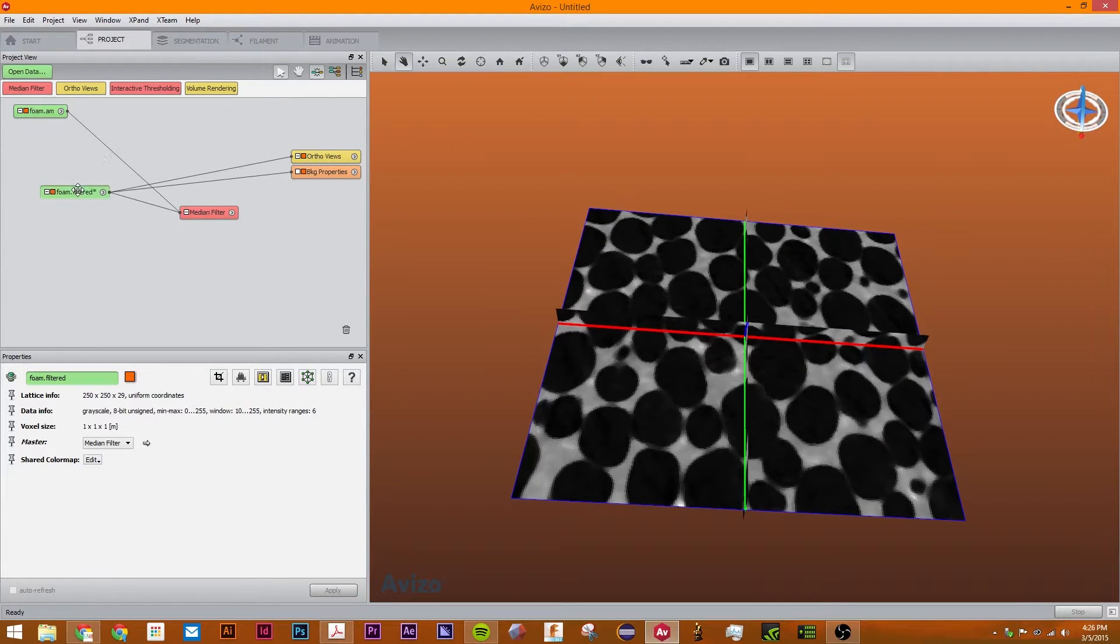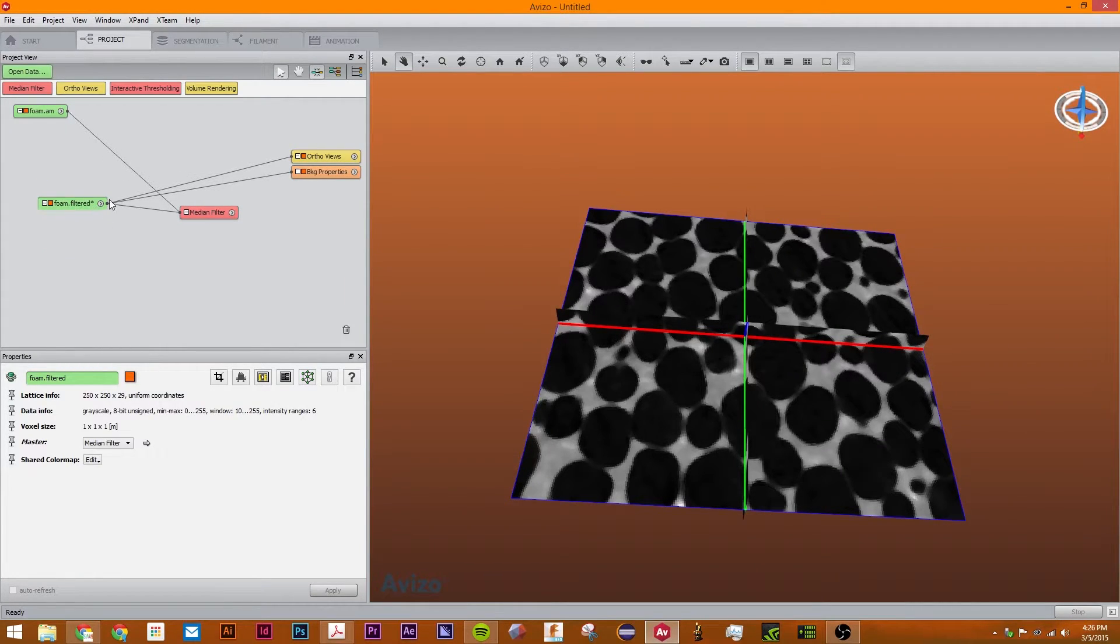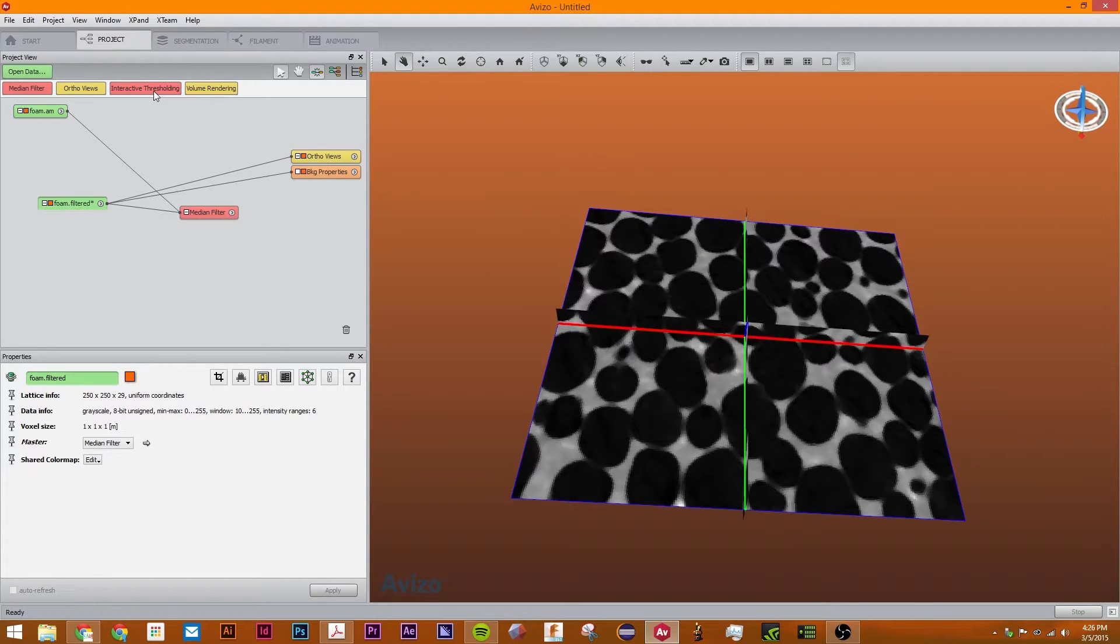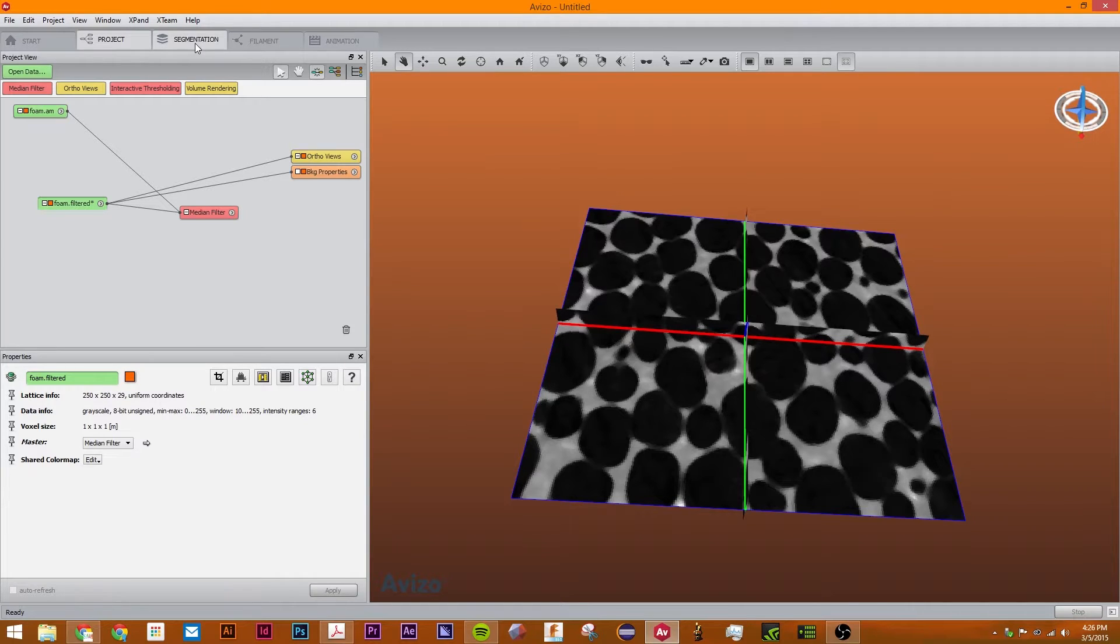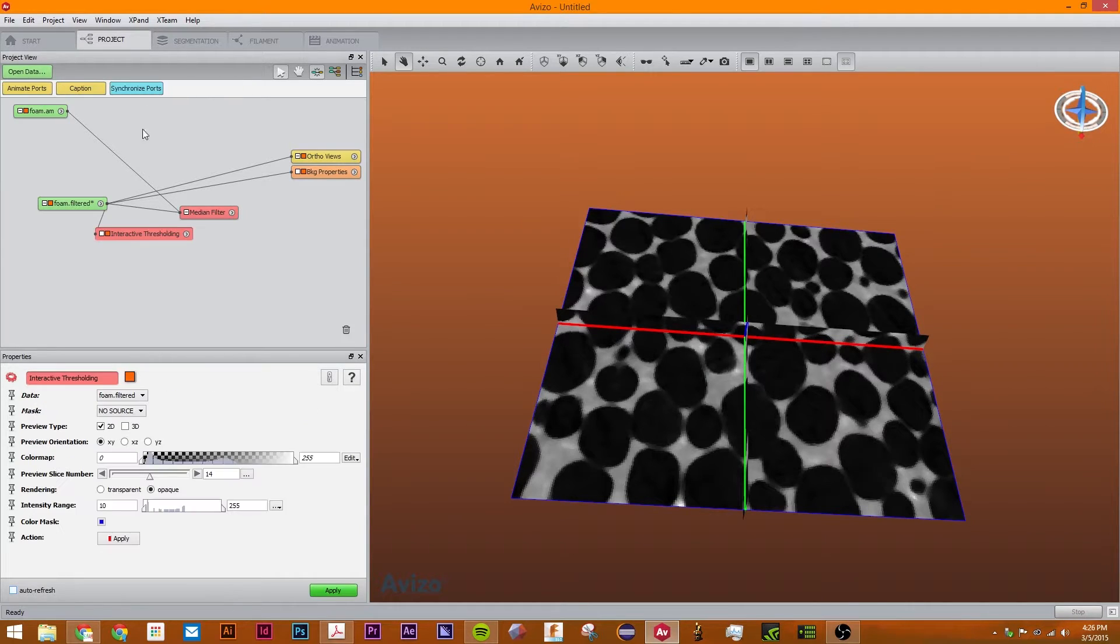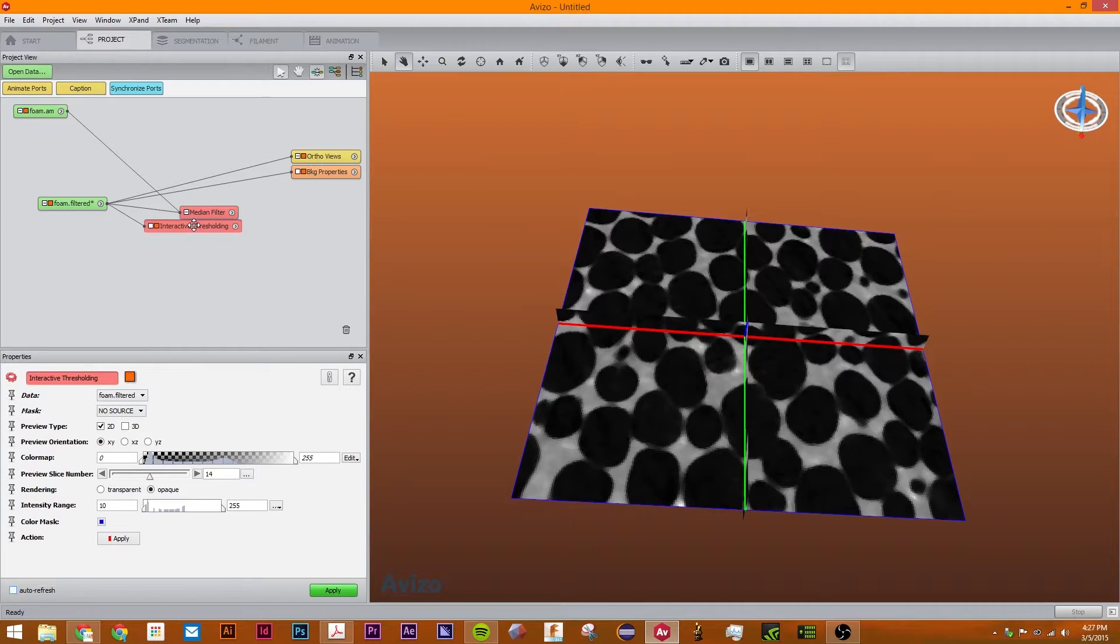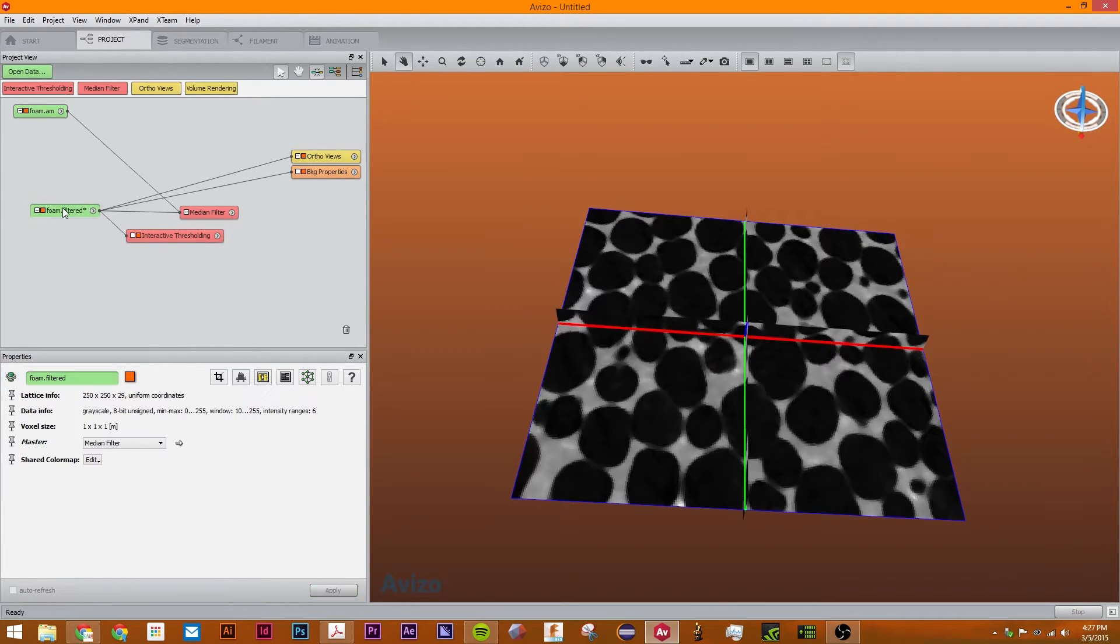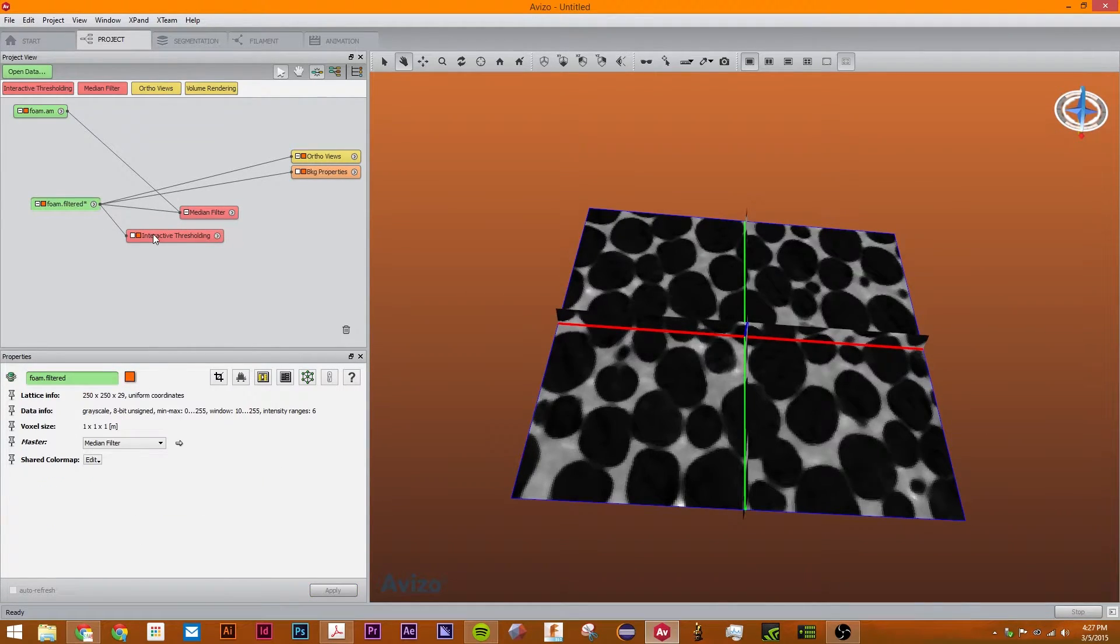The next thing we're going to do is I want to create this into a surface. I want to create this into a binary image instead of grayscale. How we do that is we can either use the label segmentation editor, or we can use interactive threshold. So we're going to use interactive thresholding.